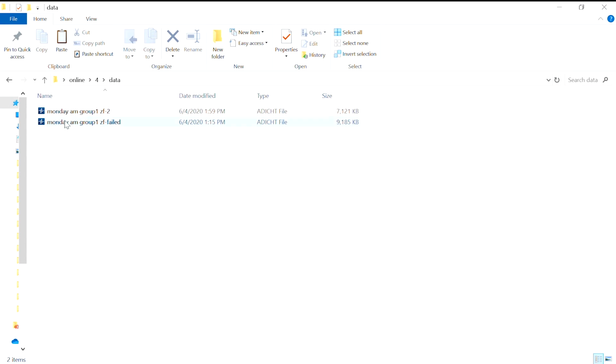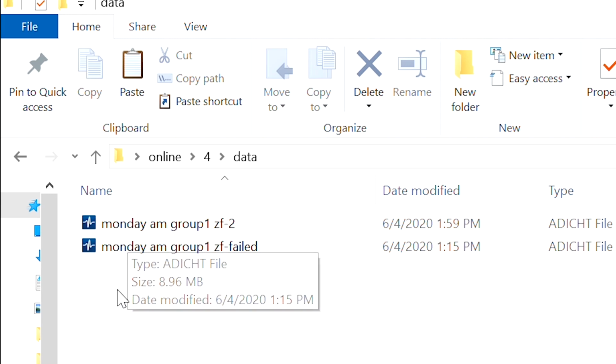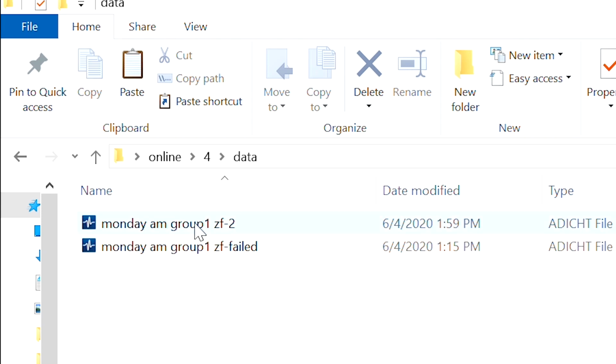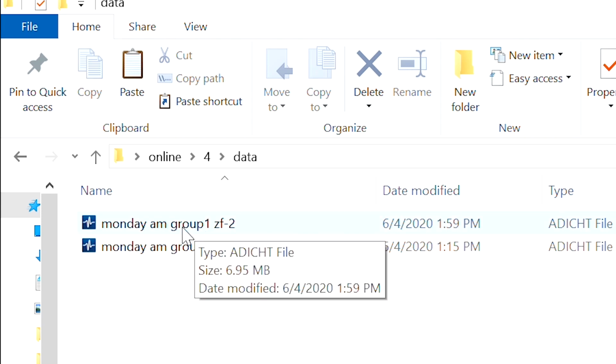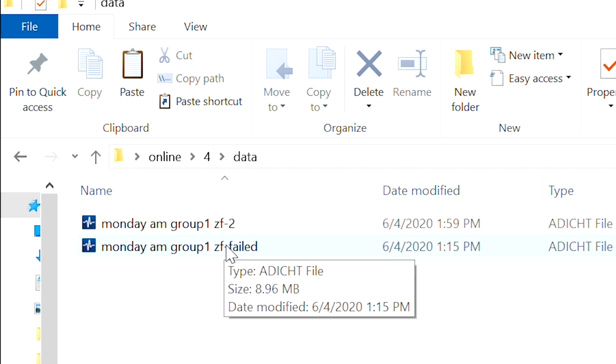Okay, so here's the data you will be able to download from Canvas, and this is the data that I collected in the first round of the experiment, and then I figured out it's completely wrong. That's the experiment I did following the previous instructions, and then I did some modification, and I redid the experiment, and this is way better data. So we're going to start from this one. You can download this one, take a look at how failed that is.